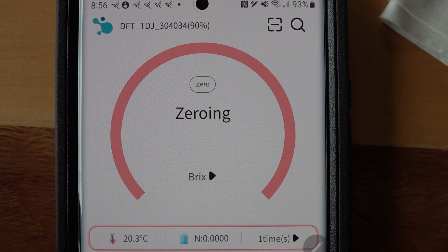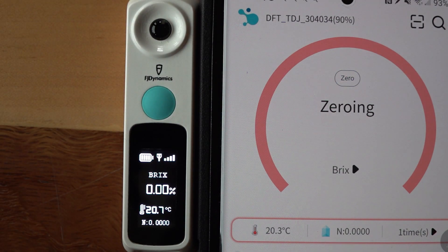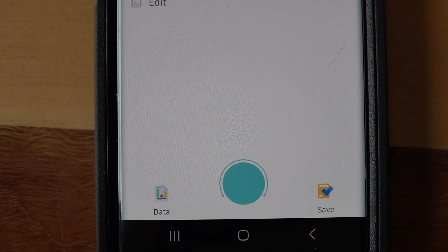It says it's zeroing. I'm not super excited about the app, and the app is just as important as the unit itself because it all has to work together. The unit now reads 0.00 Brix. This device can be used to test a lot of other things, but the only thing I care about is honey water percentage. At the bottom left it shows 20.3 degrees Celsius — you can go in and change that to Fahrenheit, which I'll do in a minute.